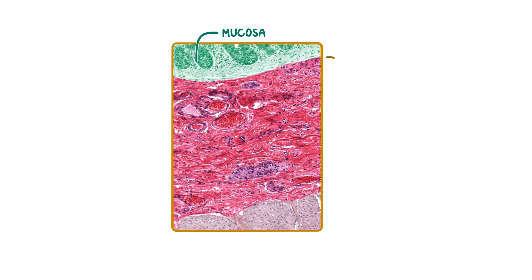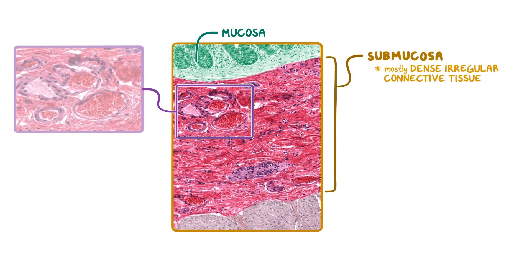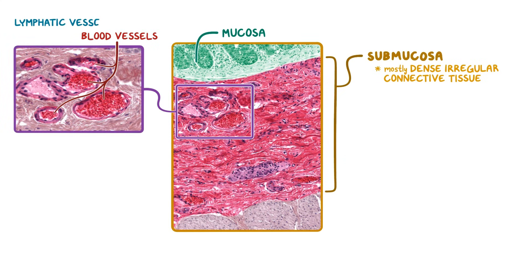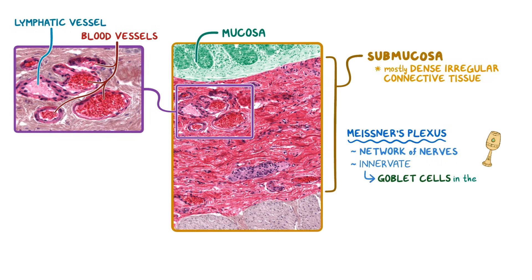Beneath the mucosa is the next major layer of the colon, the submucosa. This layer consists mostly of dense irregular connective tissue, but also contains blood vessels, lymphatic vessels, and the submucosal or Meissner's plexus. Meissner's plexus is a network of nerves that innervate the goblet cells in the mucosa as well as the smooth muscle of the muscularis mucosa. In this image, there's a relatively large cross section of a bundle of nerve cells that are part of Meissner's plexus, as well as a number of large blood vessels and a lymphatic vessel in the upper left of the image.